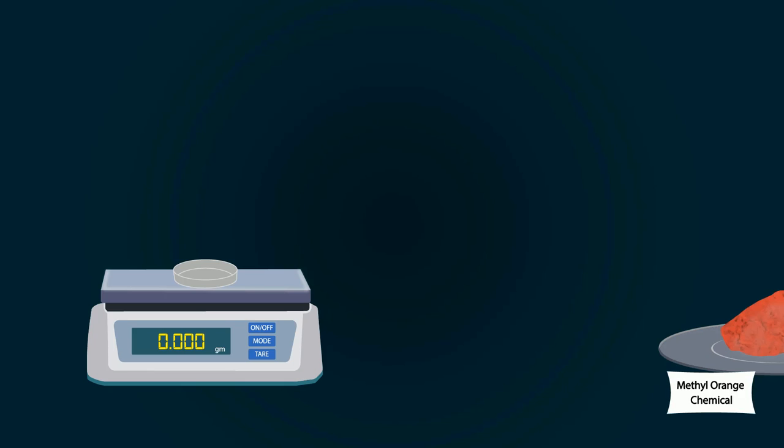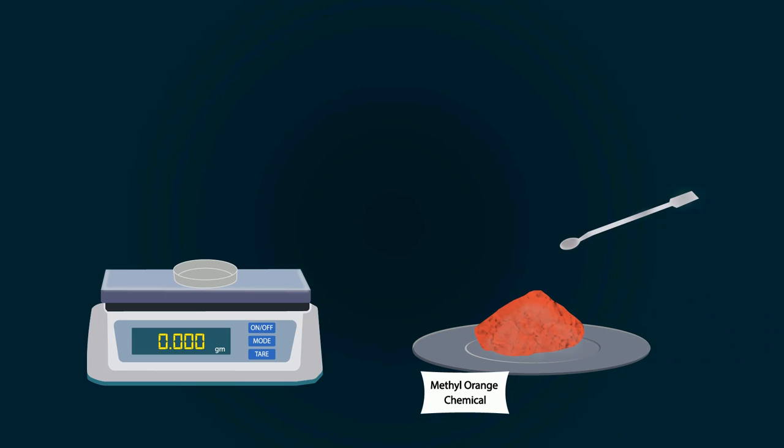Now take methyl orange chemical from the stock bottle. You can put methyl orange into the petri dish with the help of a spatula. Weigh precisely up to 1 gram.